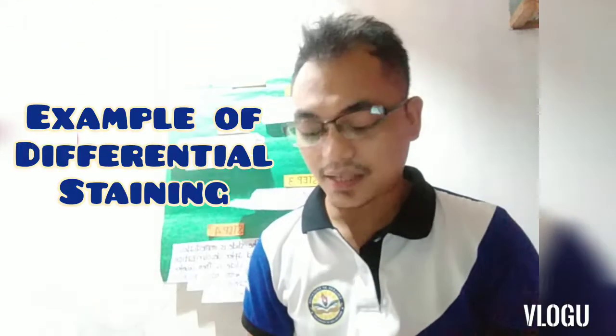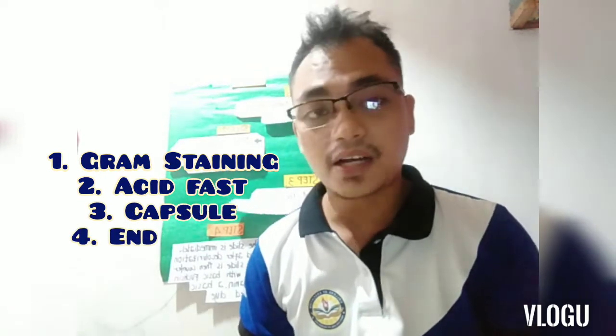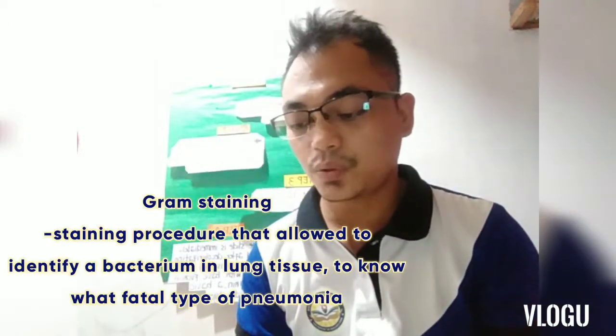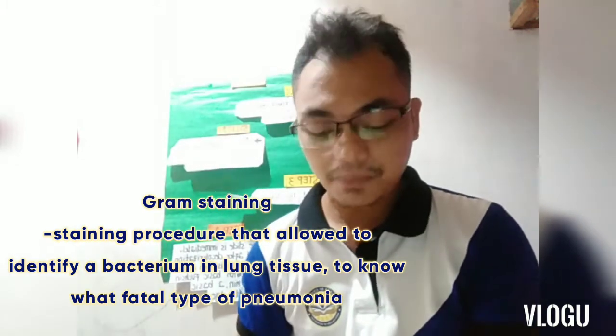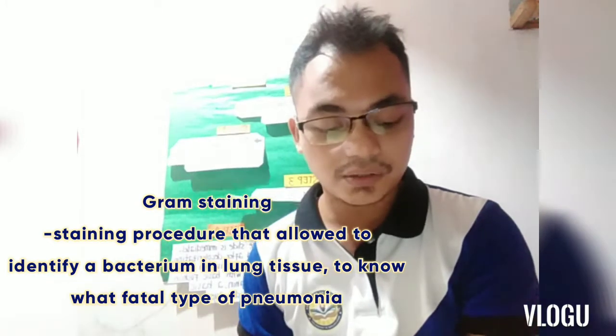Okay, class. These are the examples of differential staining. There are five examples: gram staining, acid-fast, capsule, endospore, and flagella staining. First is gram staining. It is the most commonly used differential stain and separates bacterial cells into two groups based on cell wall structure: gram-positive and gram-negative. Gram-positive cells stain deep purple and have a thick peptidoglycan cell wall, a special carbohydrate. Gram-negative cells have a thin peptidoglycan layer and an outer membrane present, and stain pink.